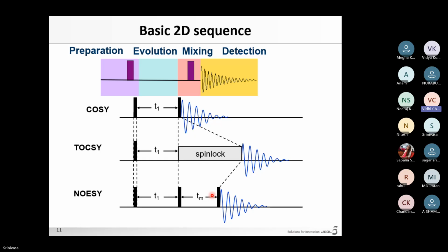It will be possible to create a new template for running the NOESY experiment. We can do that, it's not a problem, and I can teach you. It's very simple. In our terminology it is called Y scale T1. I will tell you later.